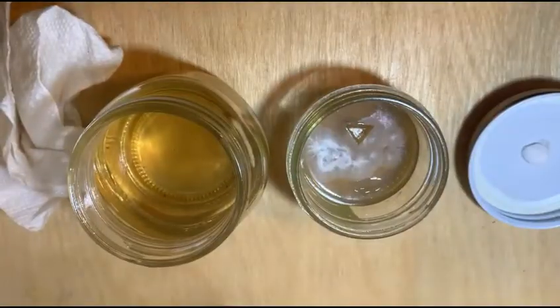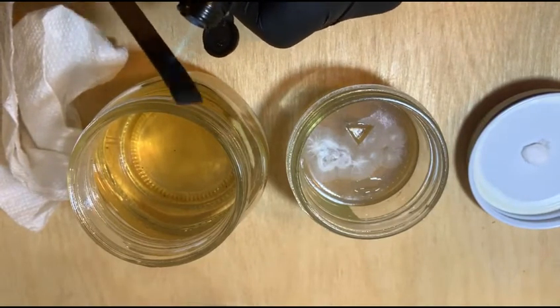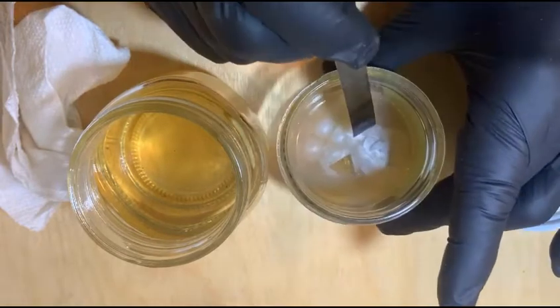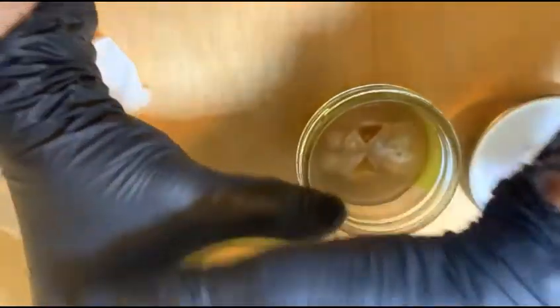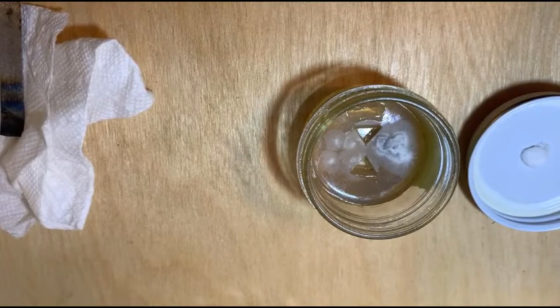I'll do the second one. That takes care of those two, aside from labeling it. And while I'm here, I'm also going to do an agar plate.